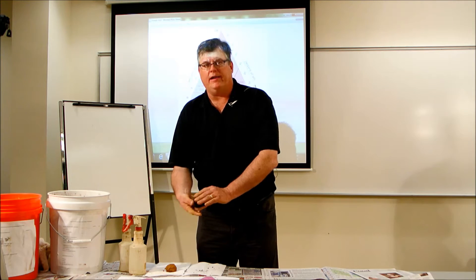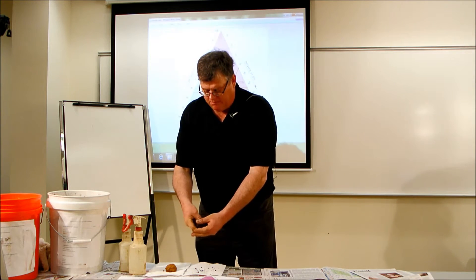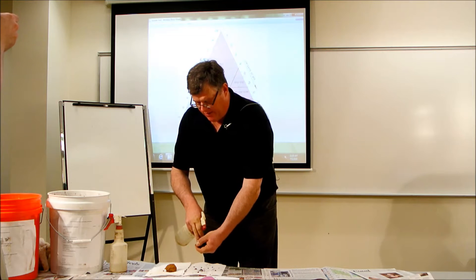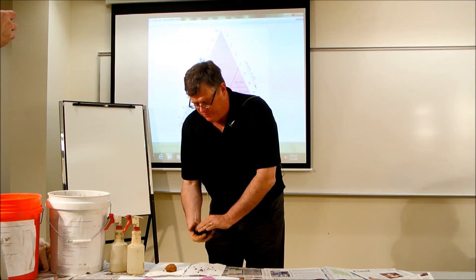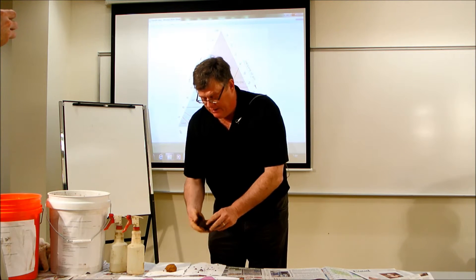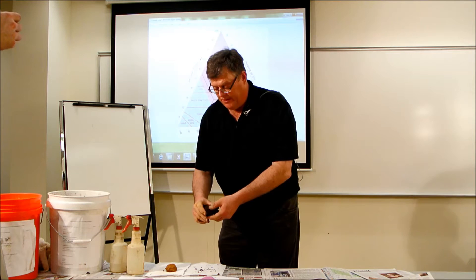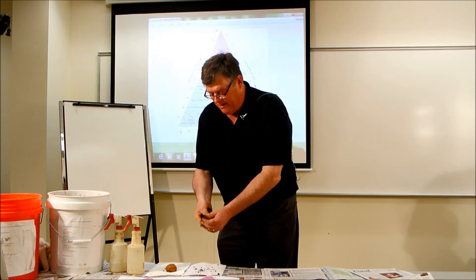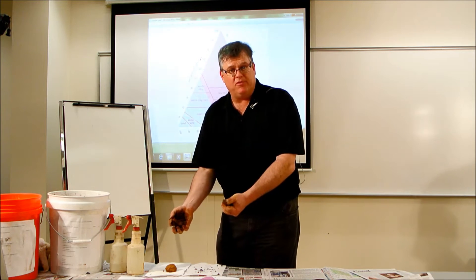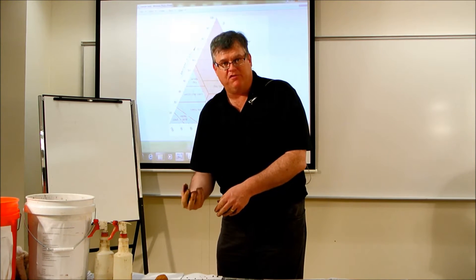We don't want them saturated and muddy, but we want them as moist as possible. This soil still has some crumbly features to it, so I'm going to wet it up a little bit more. I spray and knead it in, working it with two hands. This is a topsoil because it's very dark — it has high organic matter. Slowly this sample will become the consistency of something like Play-Doh. You definitely want to pick out any rock fragments or roots, because that will sway your estimates of the amount of sand or clay.